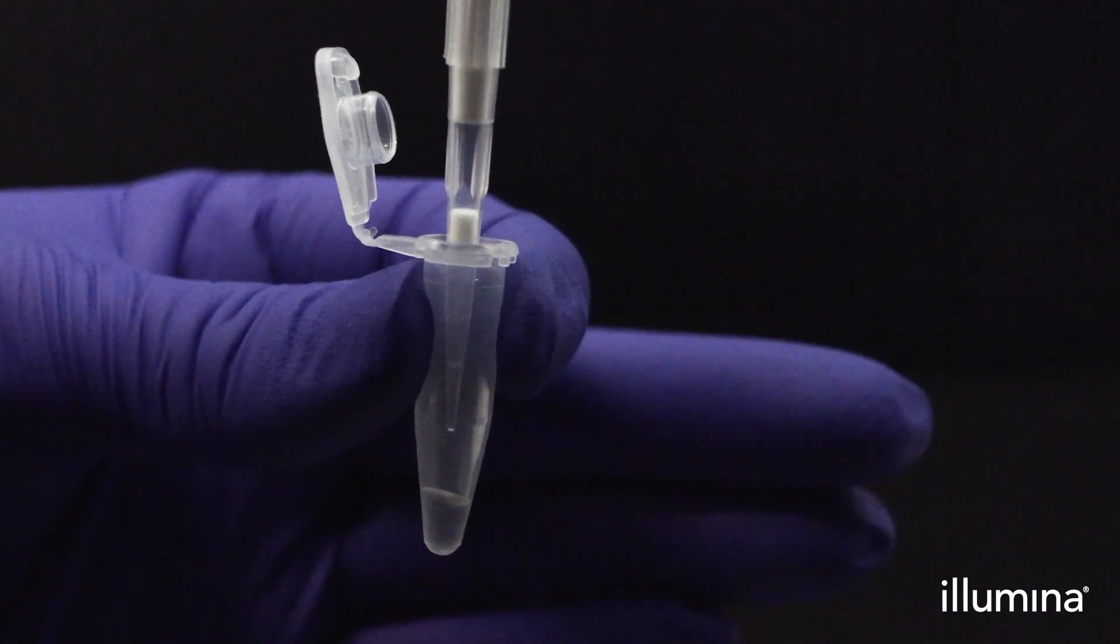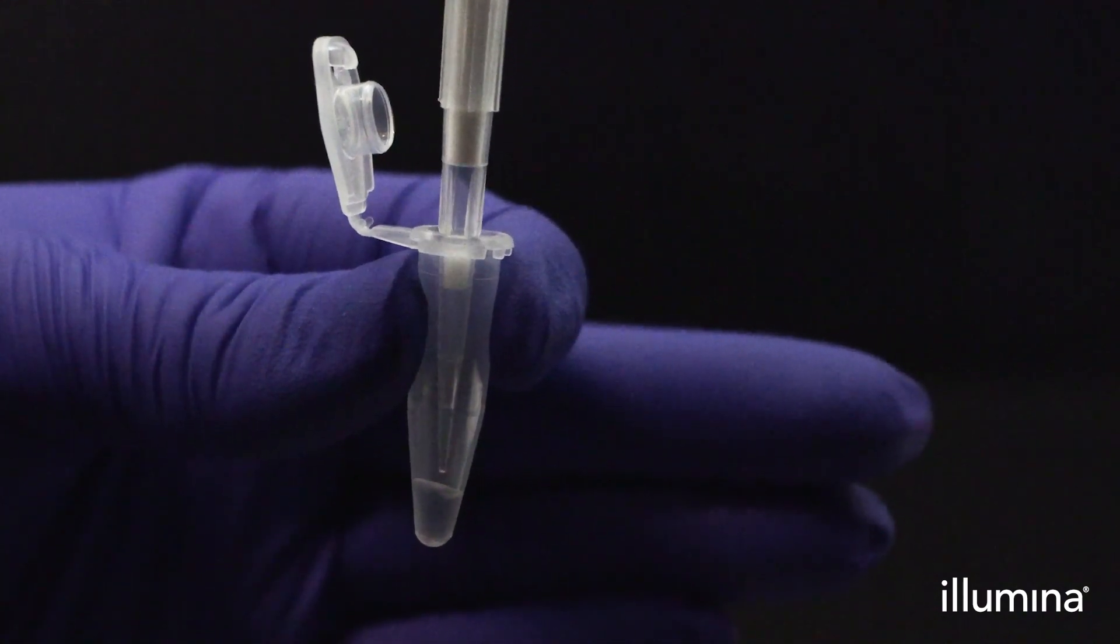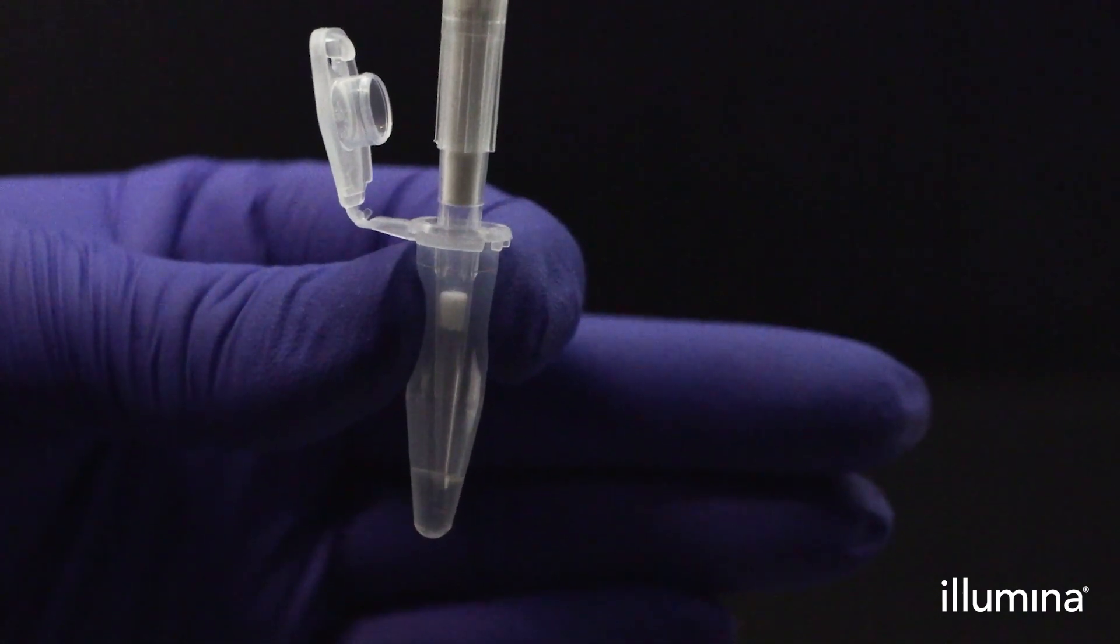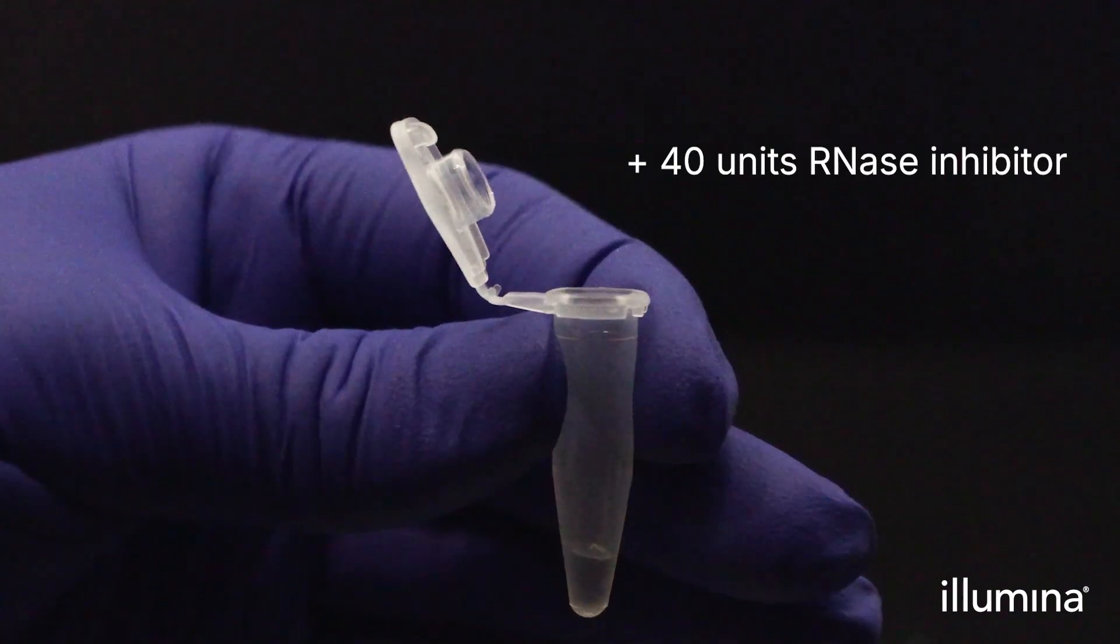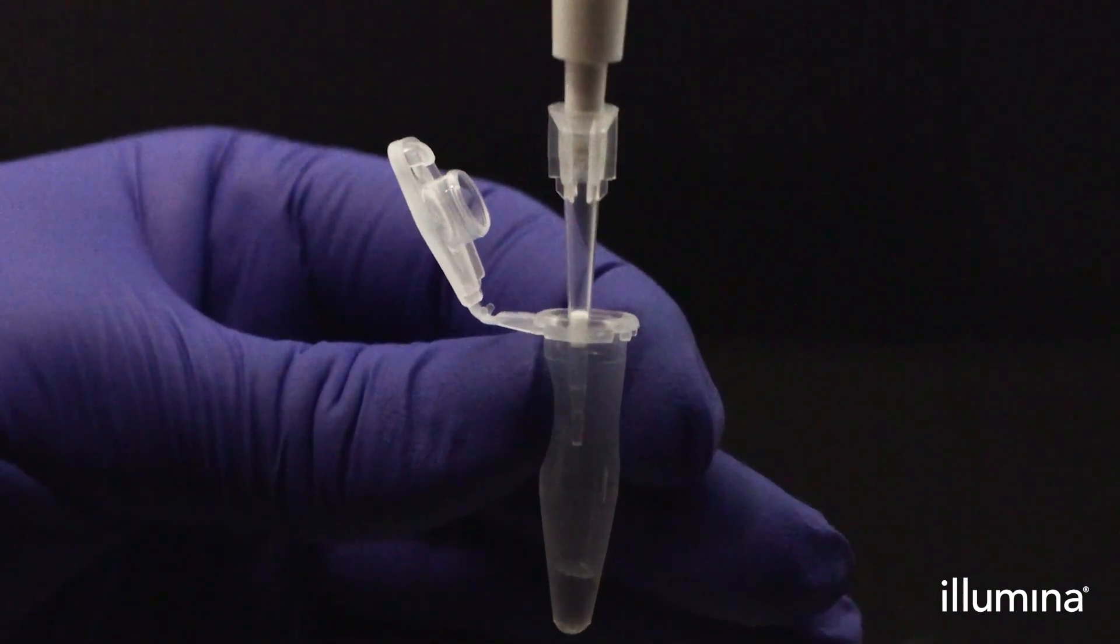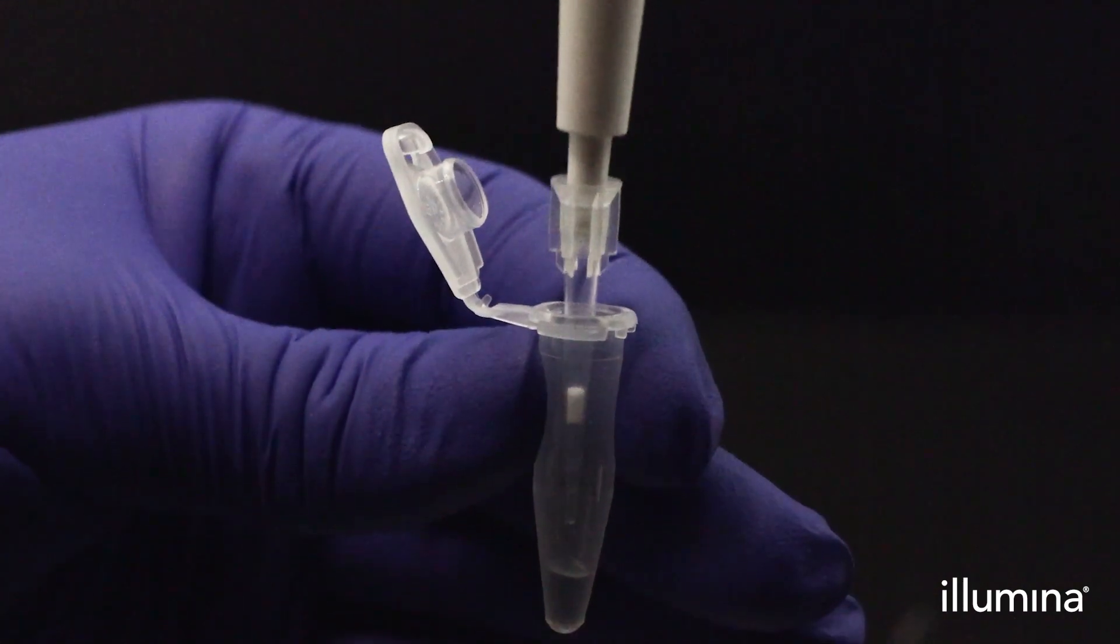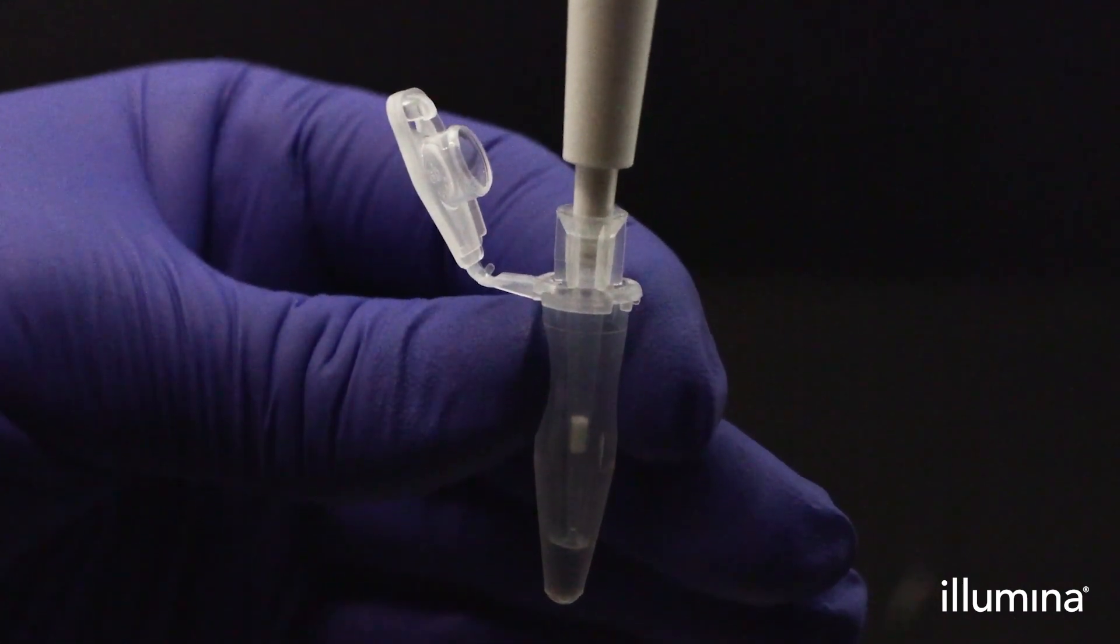Next, add 4 microliters of your freshly mixed sample plus 40 units of RNase inhibitor directly into the pips. Ensure cells or nuclei are dispensed into the pips layer, not just on the surface of the pips.